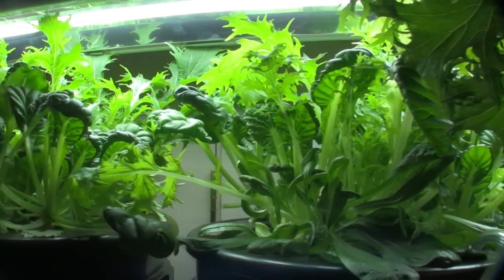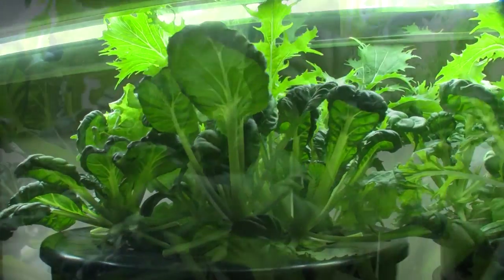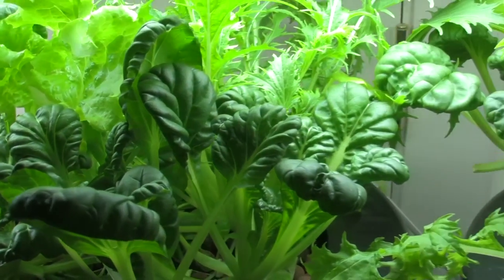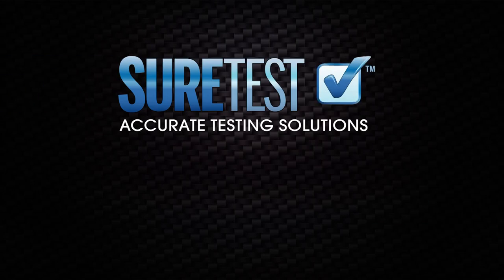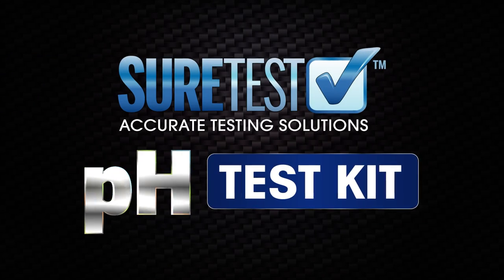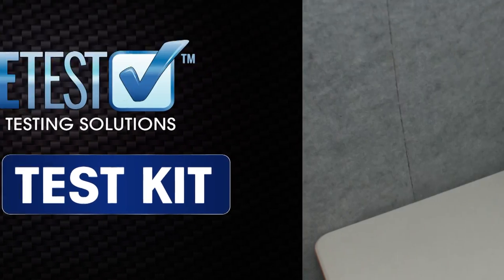One critical aspect of achieving and maintaining beautiful, healthy plant growth is to frequently check the pH balance of the water being used in soil, soilless, and hydroponic systems. The SureTest pH test kit is a fast, accurate way to determine the pH of your water or nutrient solution.